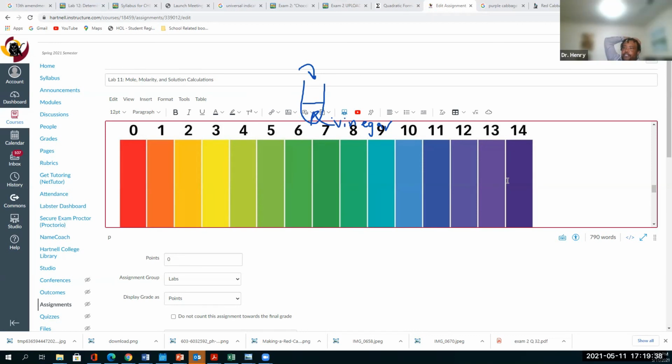Are you there? Do you have everything you need? So I did the one with the vinegar, which I'd say is a 1 or 2. A little bit orange. And then I'm doing the Kool-Aid one. It's like the same color? Yeah. Okay, so then record what color it is. And after that, the 3 indicators, that's it? That's it.